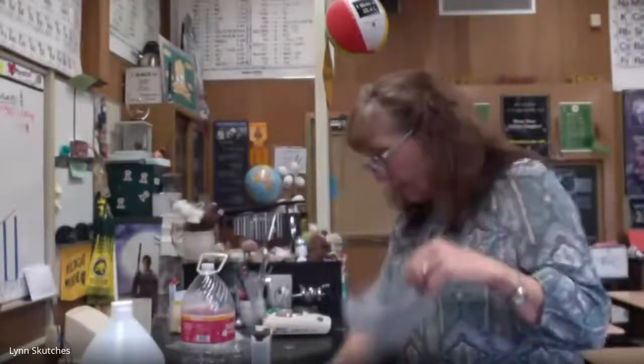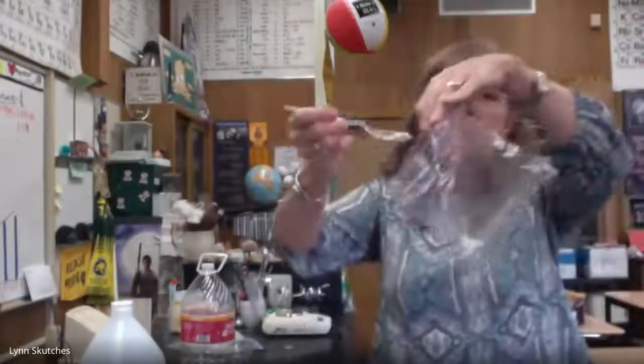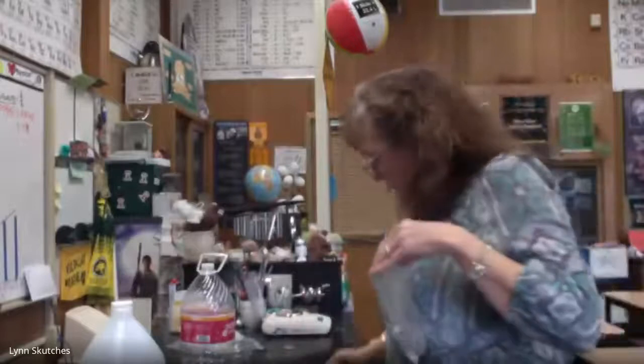So you've got a bag. You're going to take, again, about a half a teaspoon of baking soda. I wouldn't go over that. Put the baking soda in one corner. Oh, bad feature. Put the thermometer in the vinegar first and get that starting temperature. Give it a couple minutes.